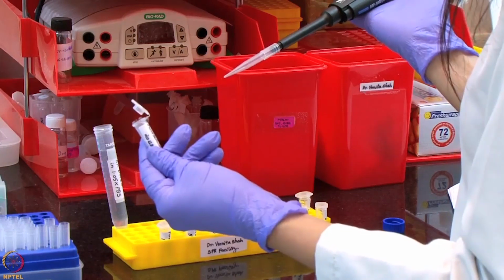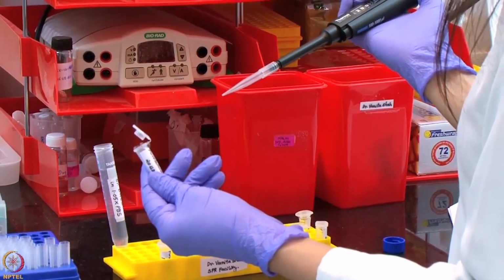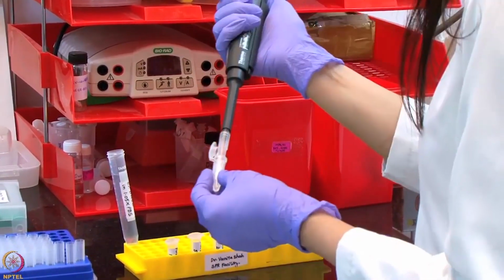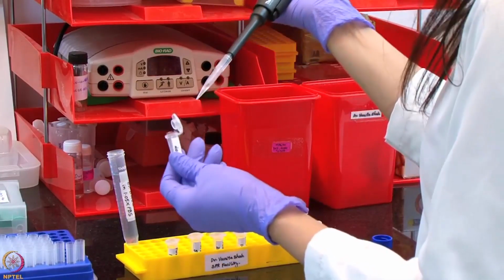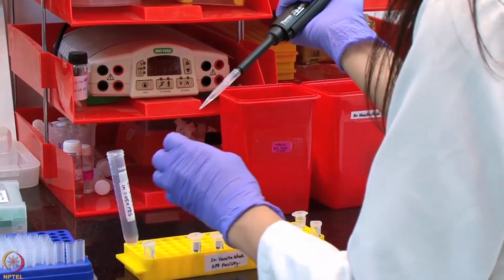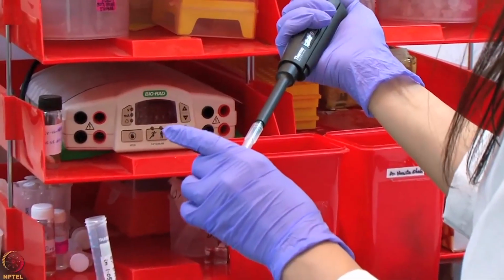We will prepare this concentration series in two-fold dilution using running buffer starting from 20 micromolar, which means we will mix 200 microliters of 20 micromolar furosemide with 200 microliters of running buffer to get the 10 micromolar concentration.